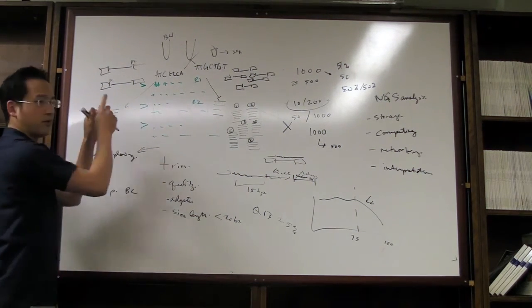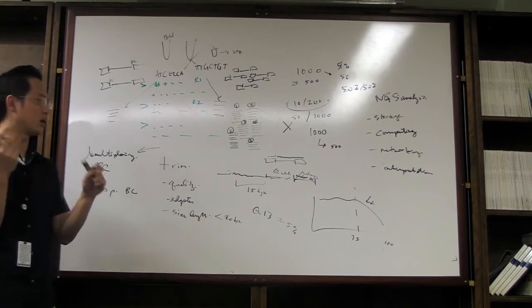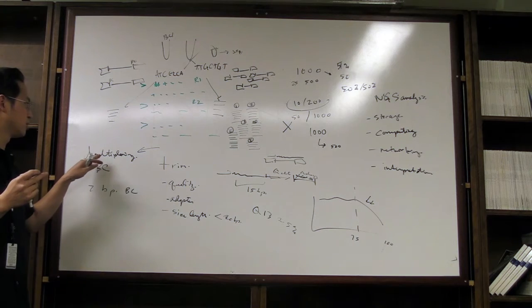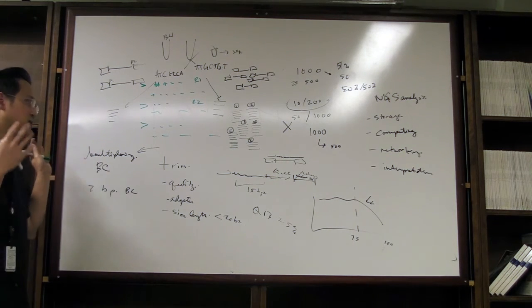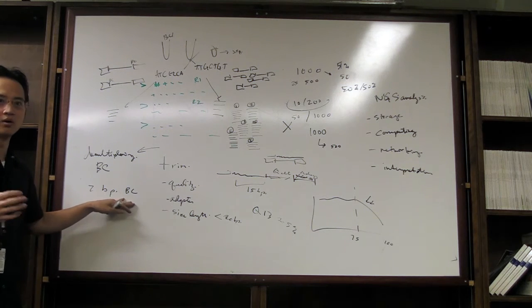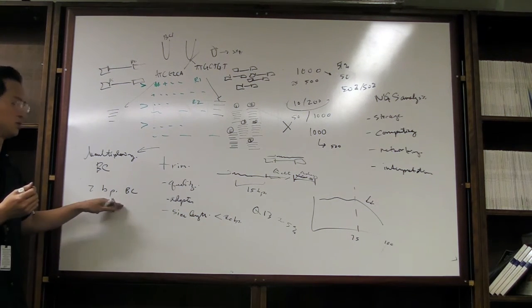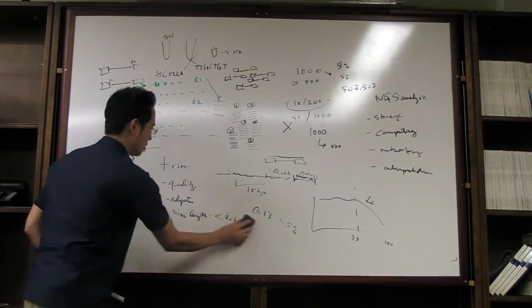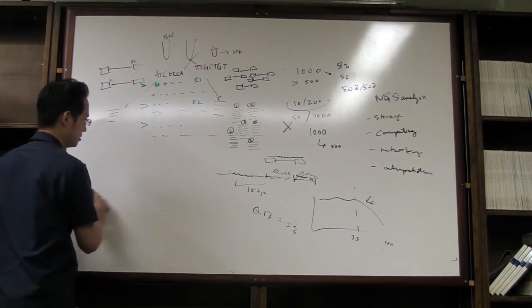And then now, from one file, you've generated 2 files, and then you can do the trimming that way. You don't want to trim before you demultiplex because who knows, something might happen to the 5' end, and you might trim away your barcode, and now it's not recognizable anymore. So you want to do this first. Okay, so then trim. Now you're ready to do mapping.